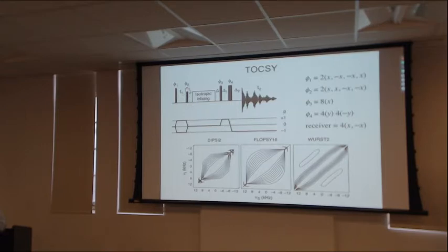This pulse then will put some of the magnetization up onto the z-axis. And then historically, there was a little delay in order to allow the RF power to be switched to the power that would be used for what's called isotropic mixing, where we'll turn on one of those sequences that generates the strong scalar coupling.